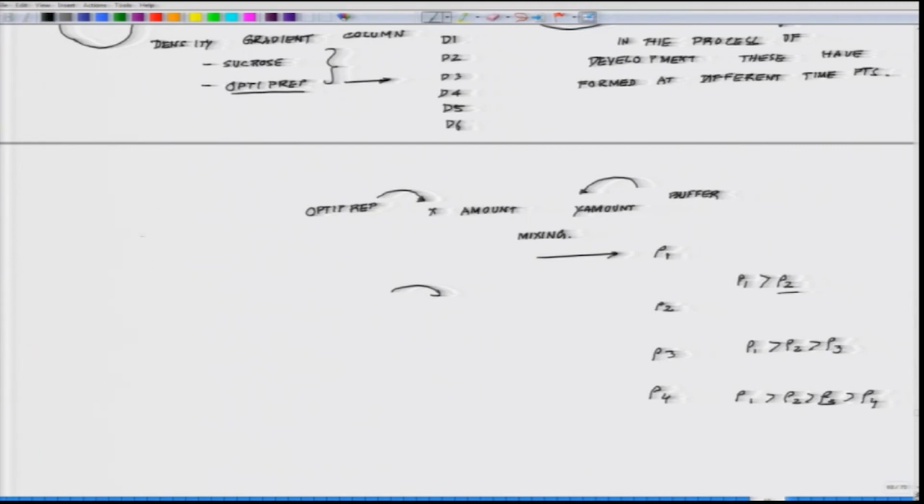Now I take a pipette, and I layer the highest density, 1 ml layering, and this layering has to be done very, very gently.